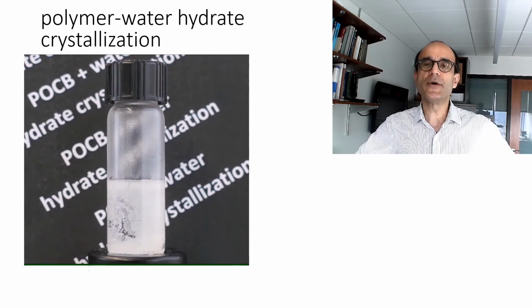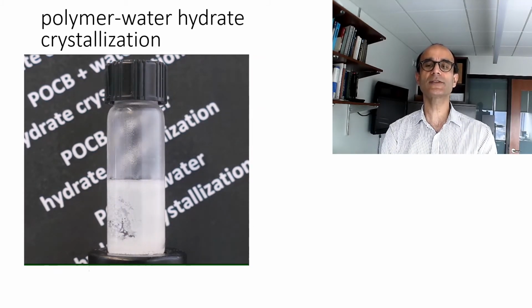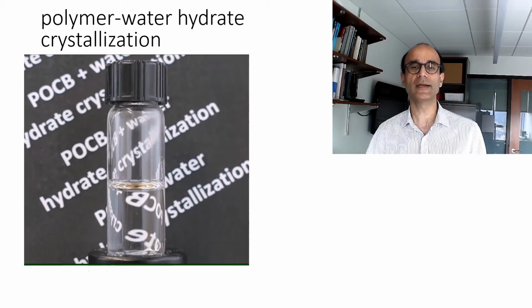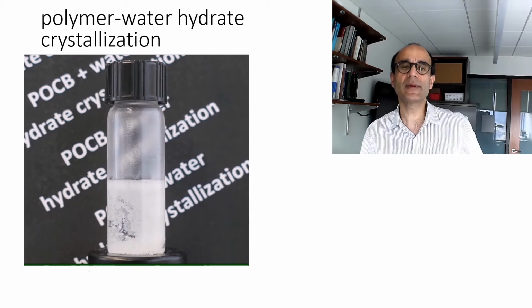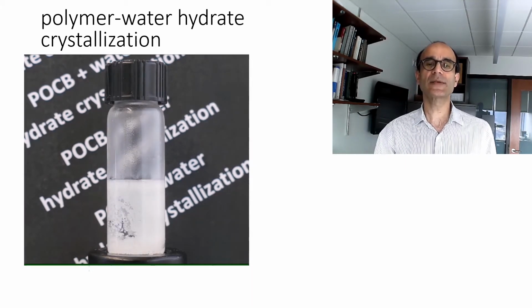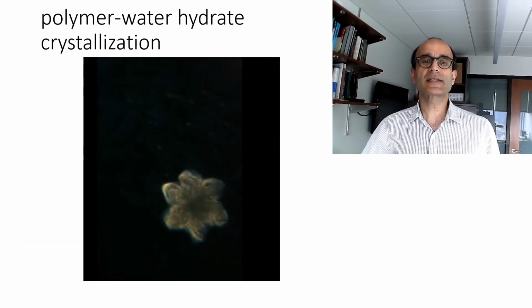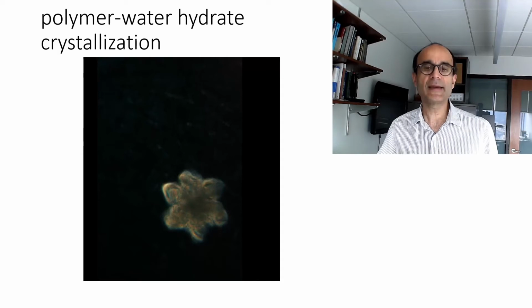So here is a video of a polymer water mixture which starts precipitating a crystalline solid hydrate, and eventually this whole thing will turn into a waxy solid. Right now we are conducting fundamental studies of the crystallization process with an eye towards eventual applications as water responsive materials. Here, for example, is how the crystal growth appears in a microscope.